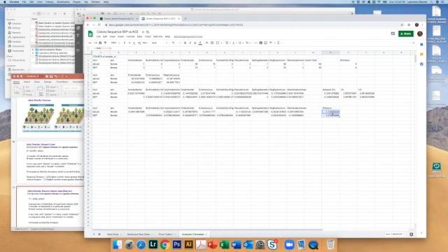In this case, Shannon's a similar calculation, but it's different, and it actually suggests that there's greater diversity among the bacterial colonies from Black Eyed Peas than there are from Idzuki beans. Not very much difference, but a little bit more diverse.